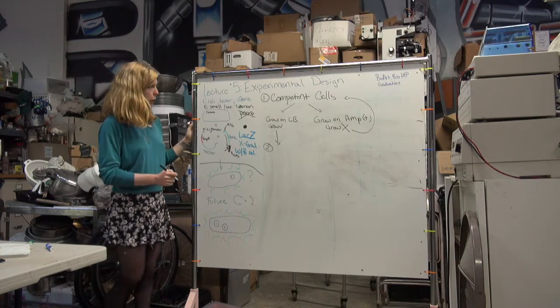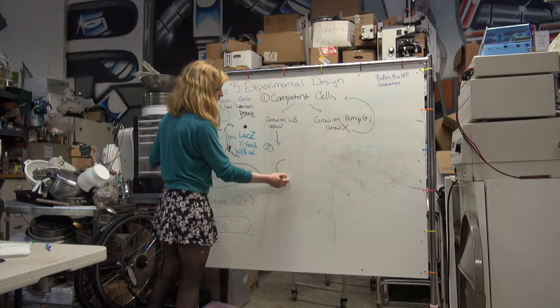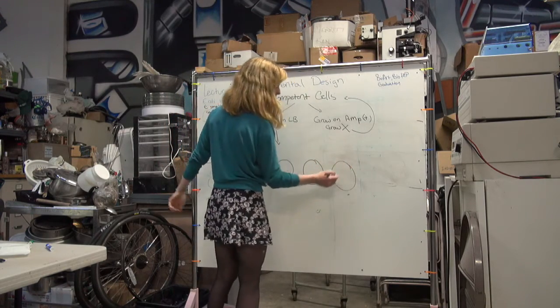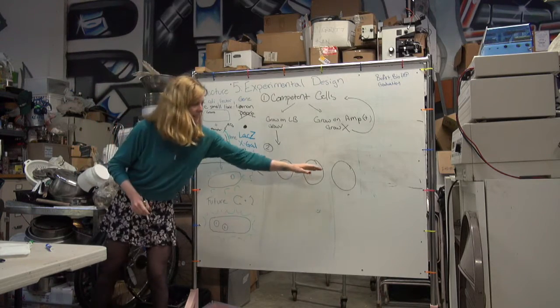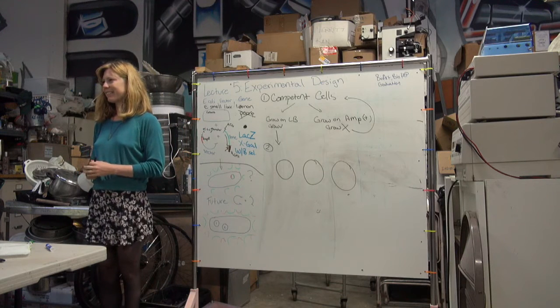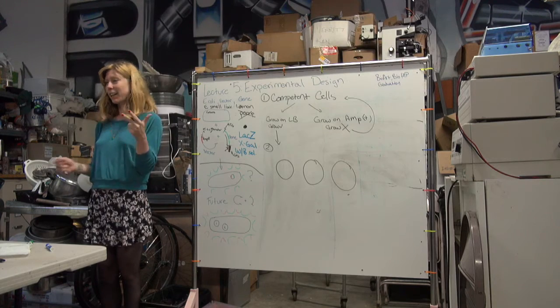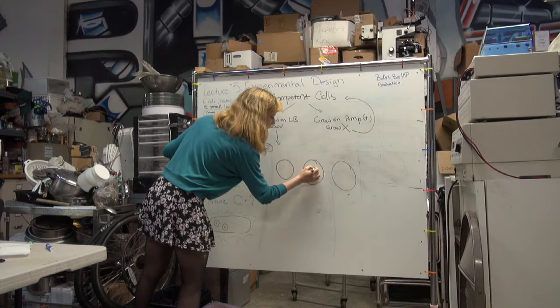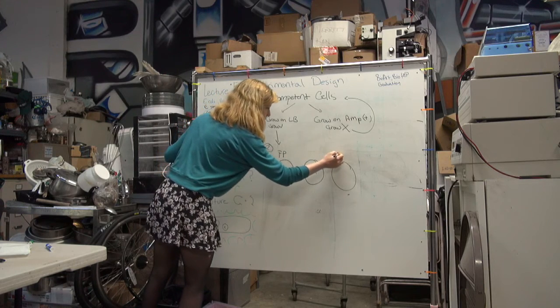And so we might as well just do our transformation with our competent cells. When we make our competent cells, we're going to plate 3 reactions. Okay? Can anybody guess what the 3 reactions are going to be? We want a false positive, a false negative, and then one's going to be a positive, our test, right? So one's going to be our test. And then we'll put FP for false positive, and false negative.